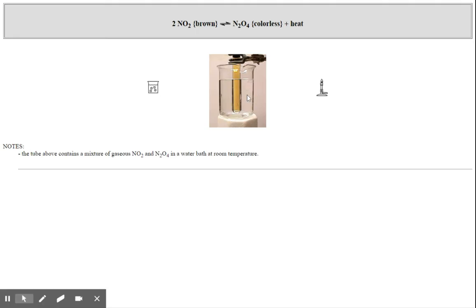So let's go back. What has happened is equilibrium has shifted left with the increase of heat. We have less of our colorless gas and we have more of the brown gas. So overall, it makes sense that our test tube looks more brown. So right there, I was explaining what happened chemically, that whole shift and why it looks more brown. That is in that third box. What do you think happened chemically? Observations are just: stress is adding heat. Observations: it looks more brown. That's it.